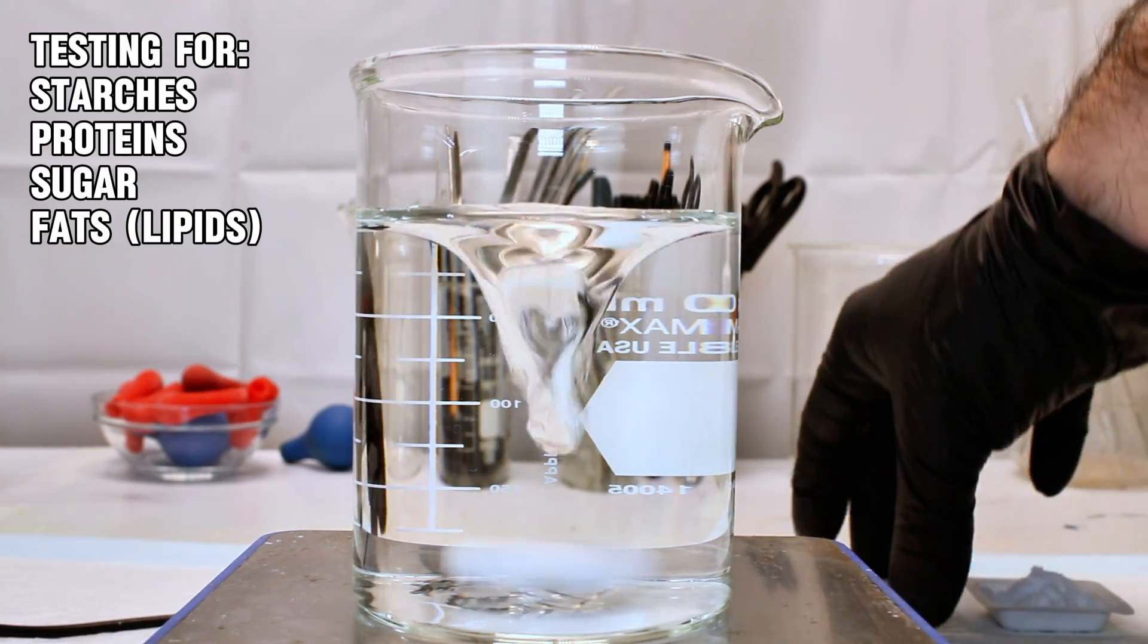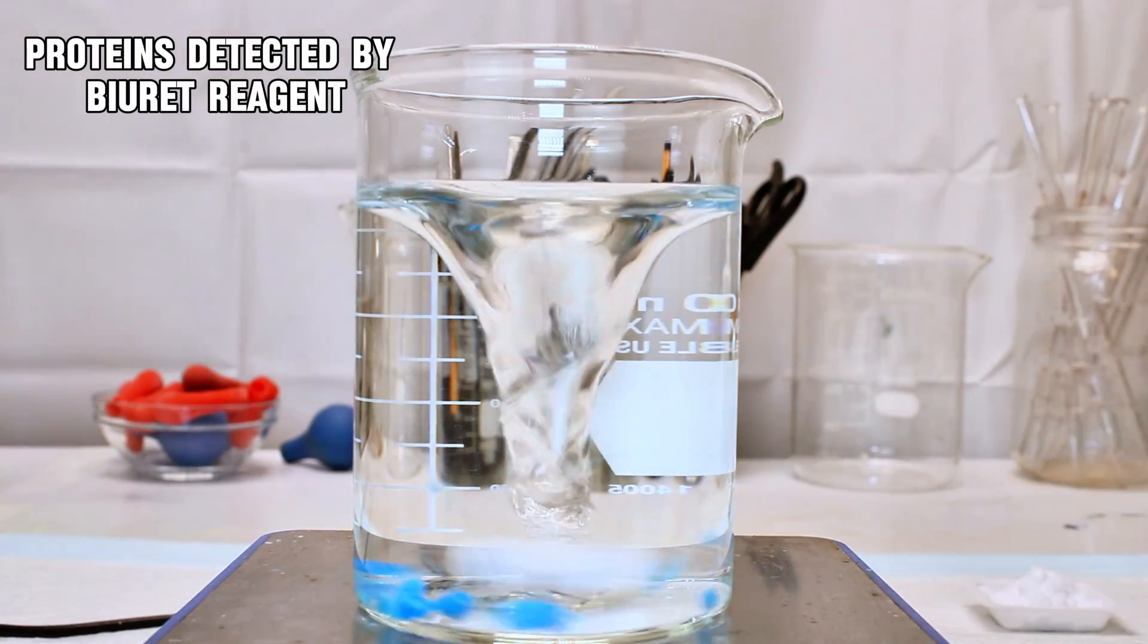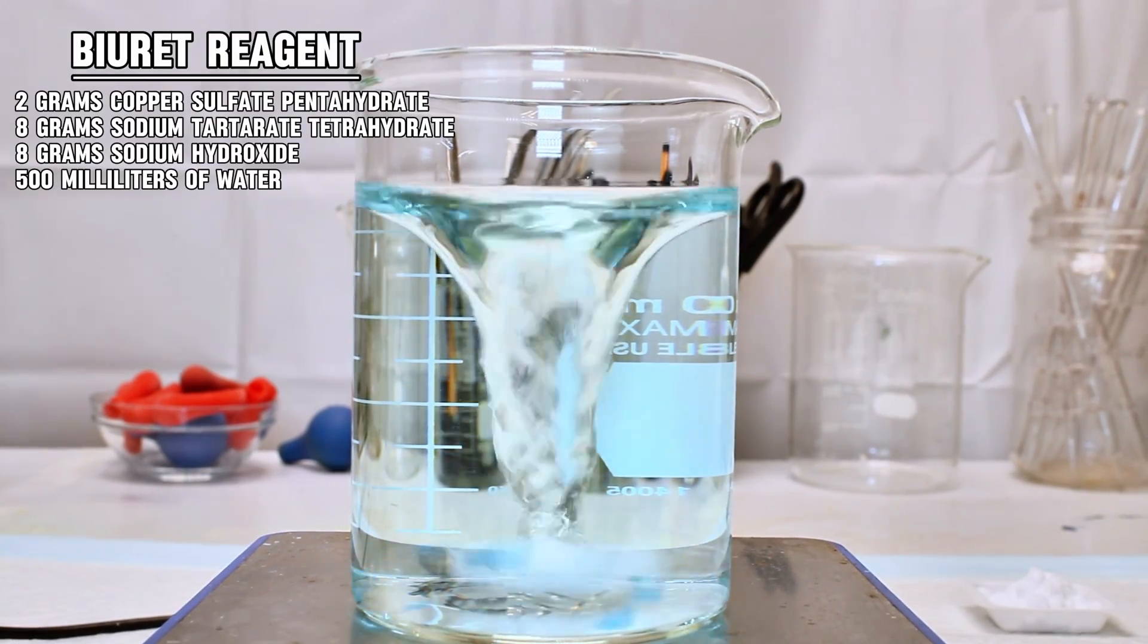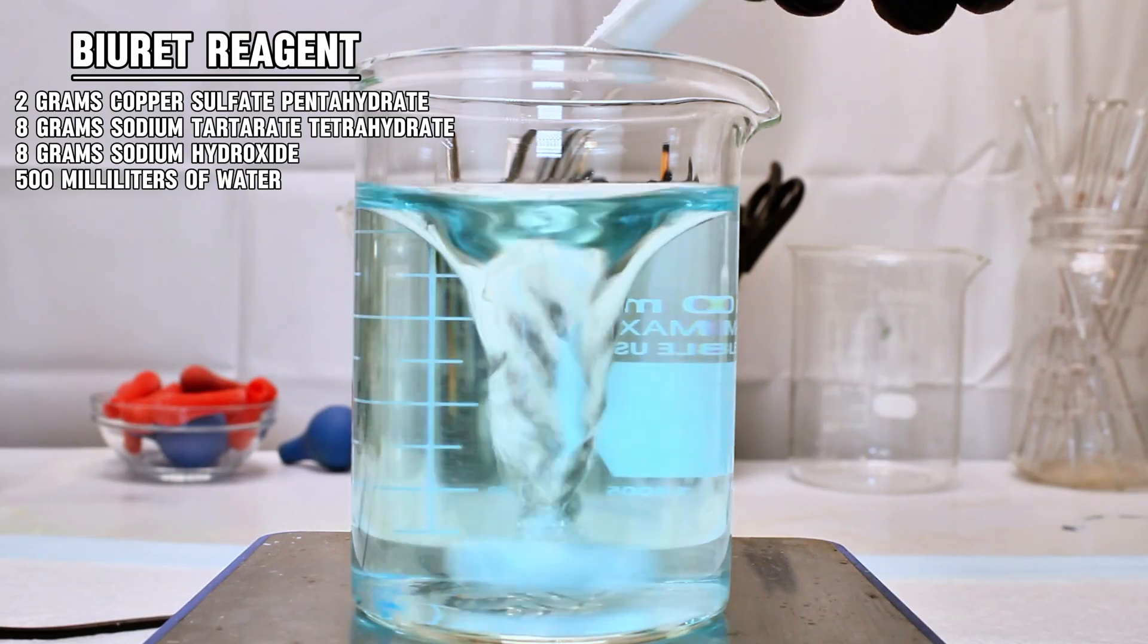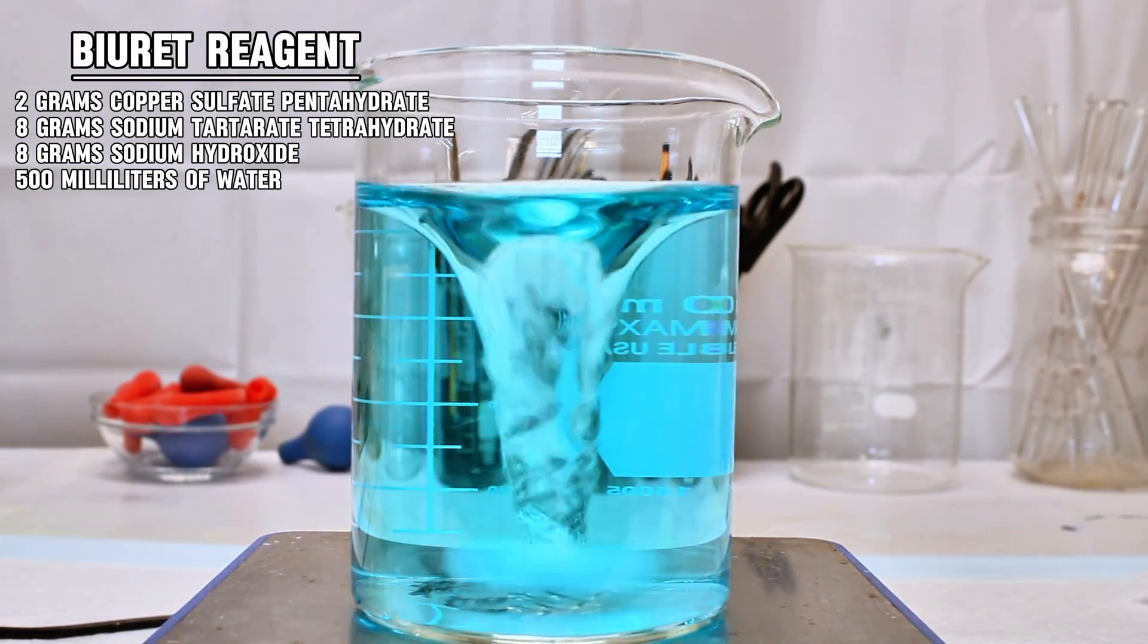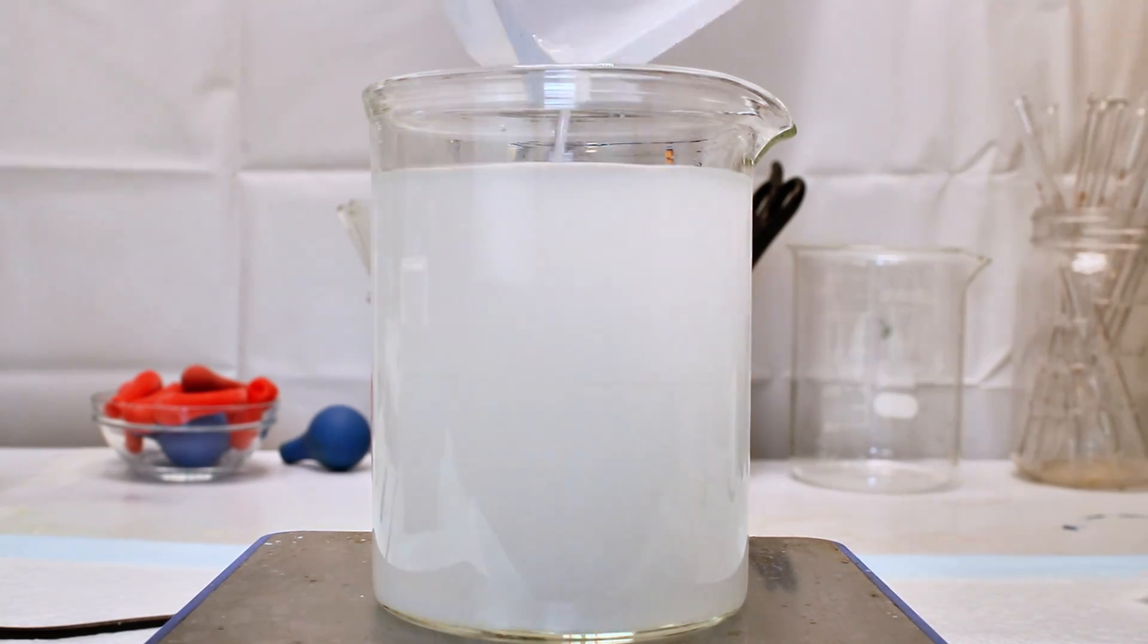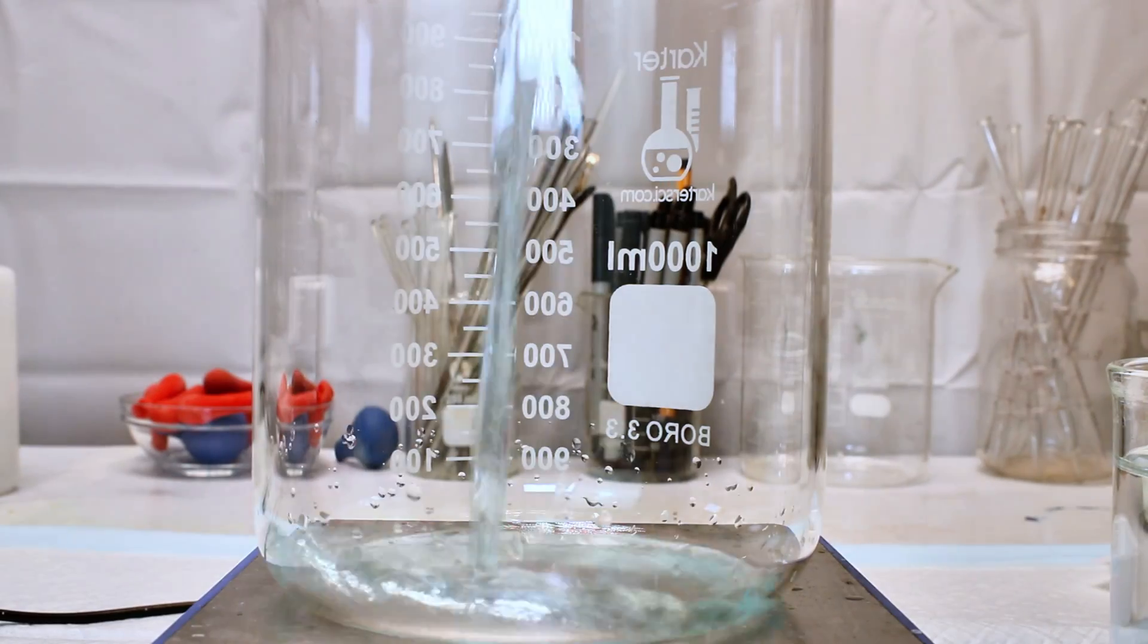To that end, the first thing I needed to do was make a solution that can detect the presence of proteins, and the easiest is the Biuret reagent. To make this reagent, I first dissolved 2 grams of copper sulfate pentahydrate and 8 grams of sodium tartrate tetrahydrate in 200 milliliters of distilled water. In a separate beaker, I then dissolved 8 grams of sodium hydroxide in another 200 milliliters of water, which I then slowly added to the blue solution of copper sulfate and sodium tartrate.